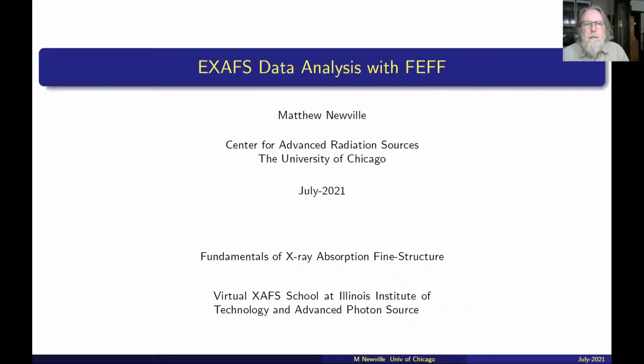To model extended XAFS data, we use Feff calculations for the photoelectron scattering factors. Because the XAFS equation is inherently nonlinear in the parameters for the near neighbor distance and other parameters describing the local atomic structure, we also use standard nonlinear least squares fitting procedures for refining the parameter values to best match experimental data. This leads to a range of topics to discuss about how to fit data.